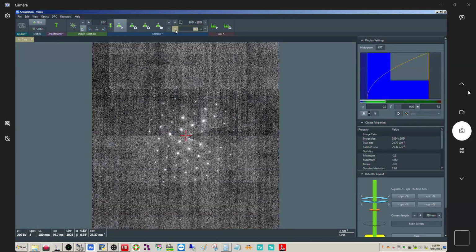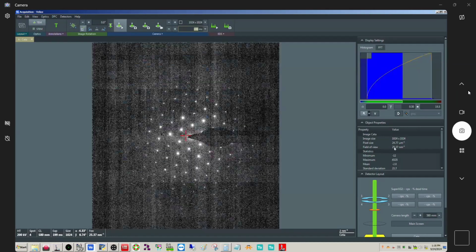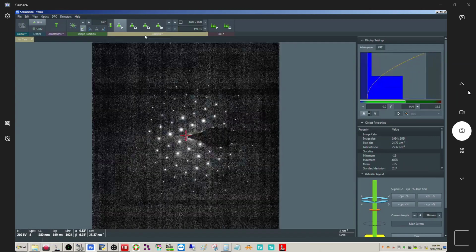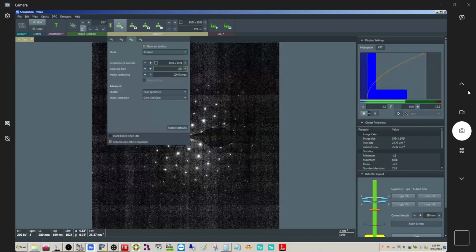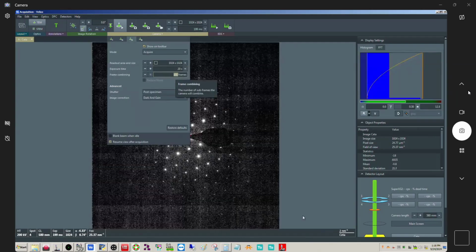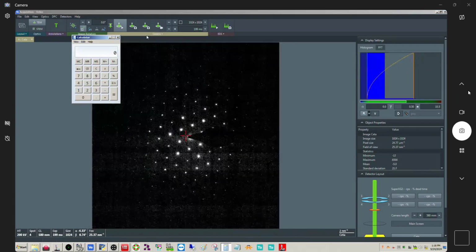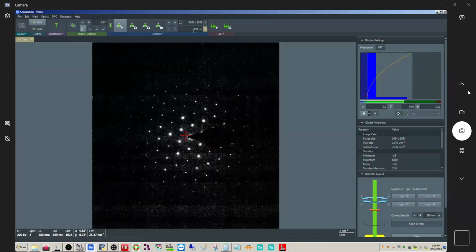Okay, so I was able to increase this to, now if I go to 200, okay, so I'm still not clipping, so I'm still safe here. So let's see. If I do 20 seconds, and let's see. Oh, math is hard. Okay, that's right. 20 divided by 100 should give me 200 milliseconds a frame.